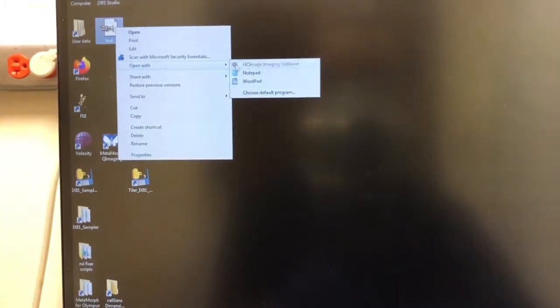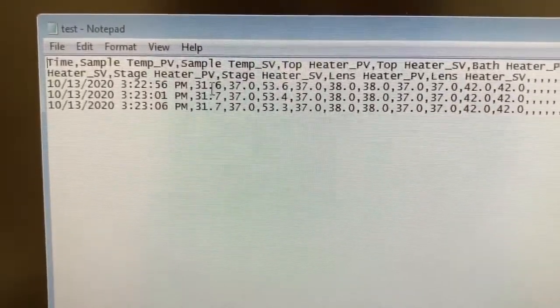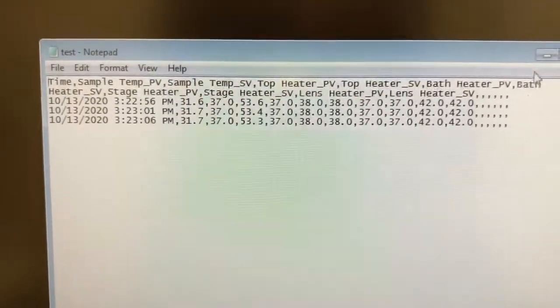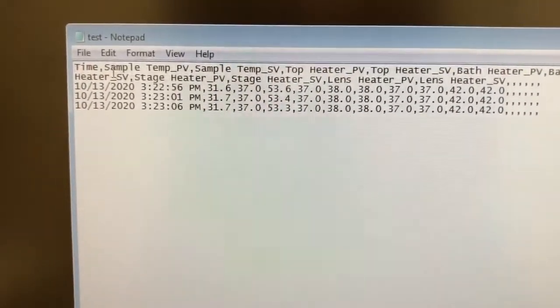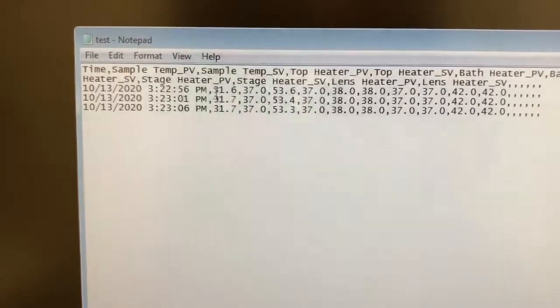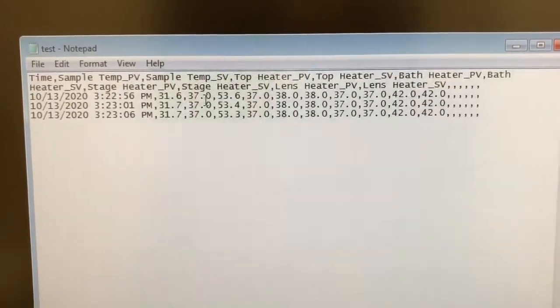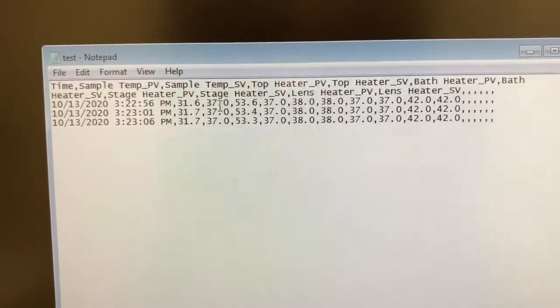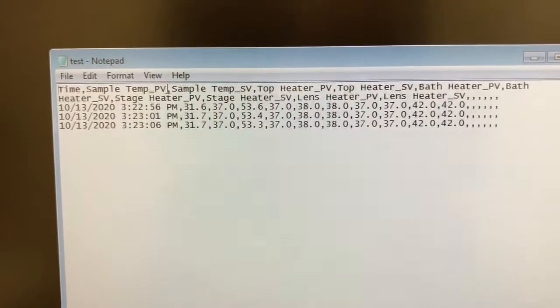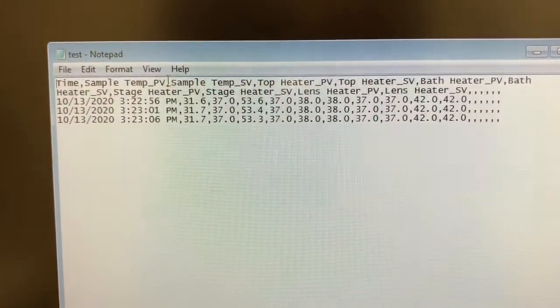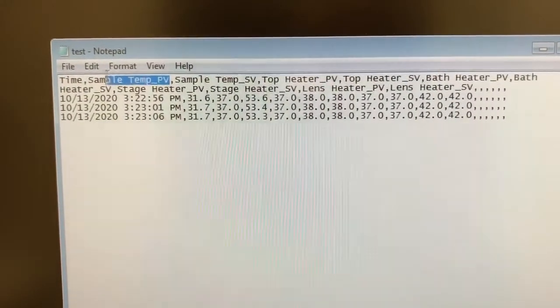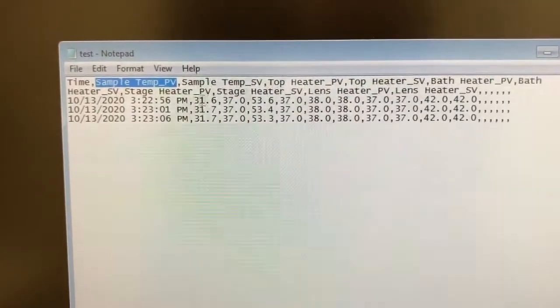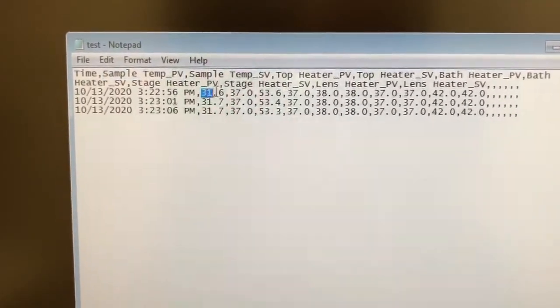And let's just take a look at that so you can see what that data looks like. I'm just going to open it with notepad. And so you can see here that here it explains what the different fields are. And so you have the date, the time, and then temperatures of different things. And the sample temperature right here, the PV, is the actual temperature in the sample. You can see it's this number.